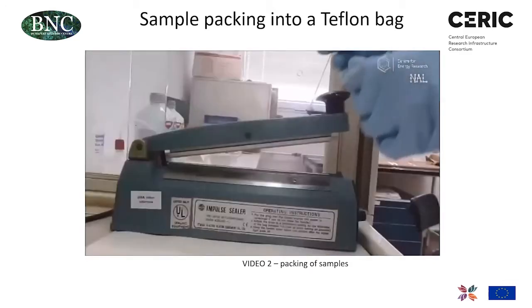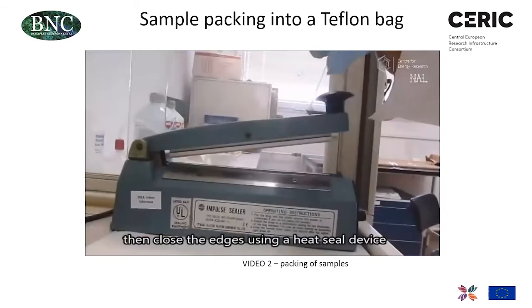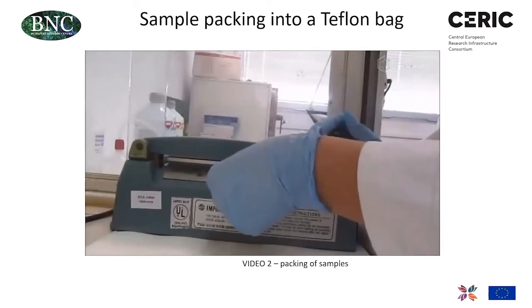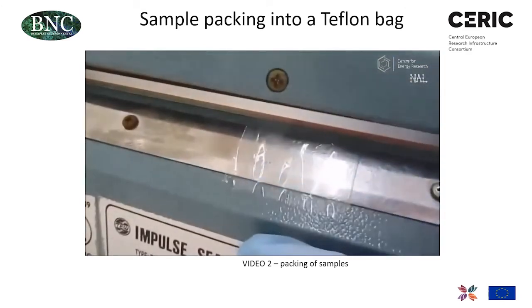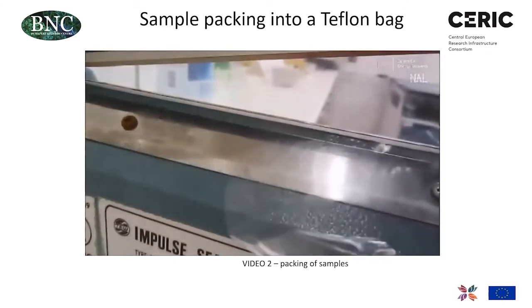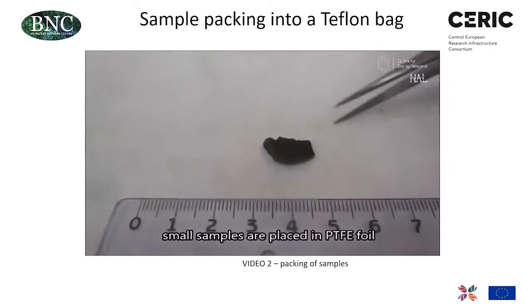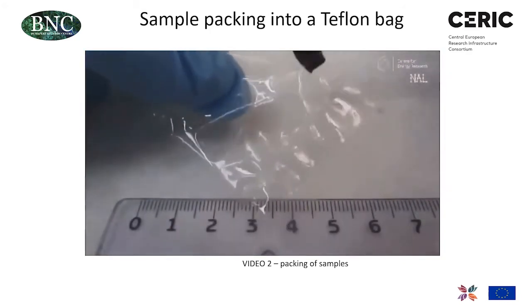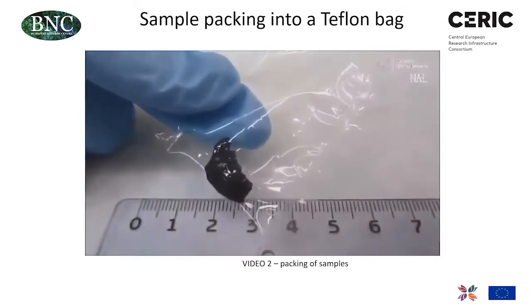As I mentioned during the lecture, the sample can be slightly radioactive for a short period of time, for a few hours, let's say. That's why it is very important to keep the powder in a closed form to avoid contamination of the facility with radioactivity. And here is a little solid sample that we can put into this Teflon bag.